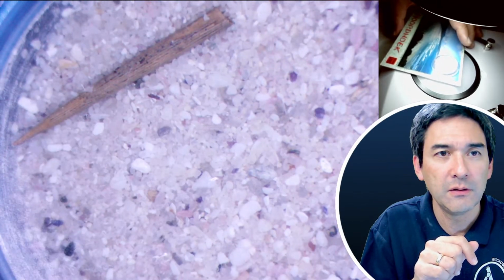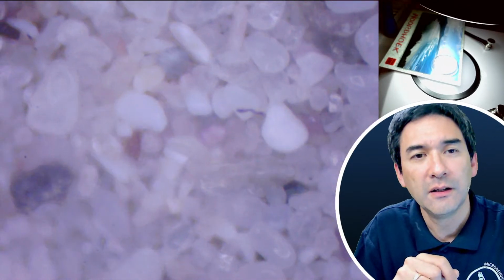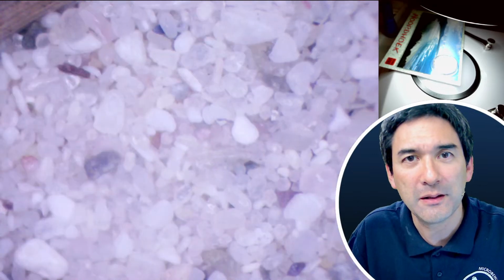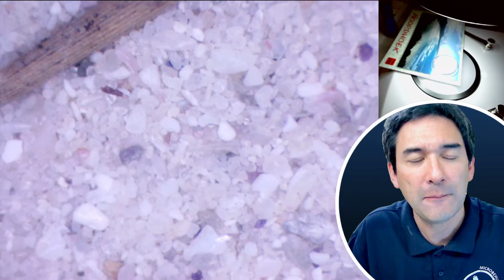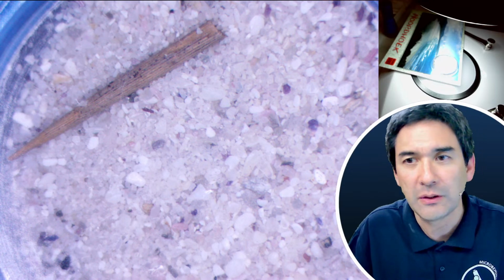And see even a little plant, the leaf in here, and then of course I'm able to zoom in. And if we're lucky, we're able to find a couple of shells of some microscopic seashells or so. Did not find so many here in those sand samples, but I think you get the point. And I would like to actually prepare them in such a way that we're able to look at them properly.